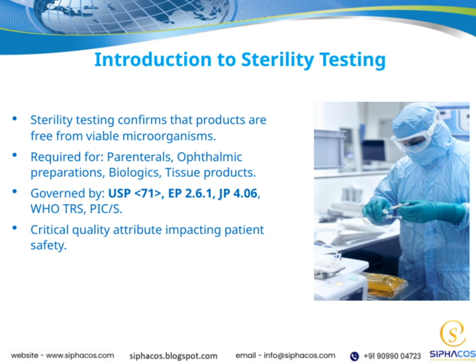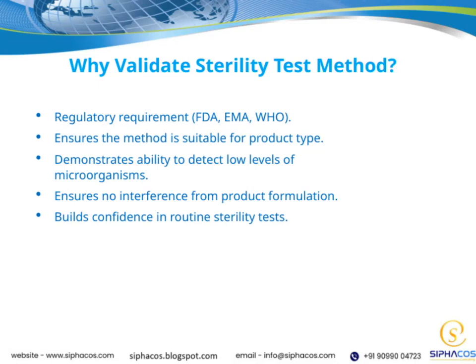It's important to remember that sterility is a critical quality attribute. It directly impacts patient safety. If a product isn't sterile, it could cause infections or other serious health issues. That's why rigorous testing and adherence to these guidelines are so vital in our industry. Overall, sterility testing is a fundamental part of our quality assurance process, helping us deliver safe, effective products to patients worldwide.